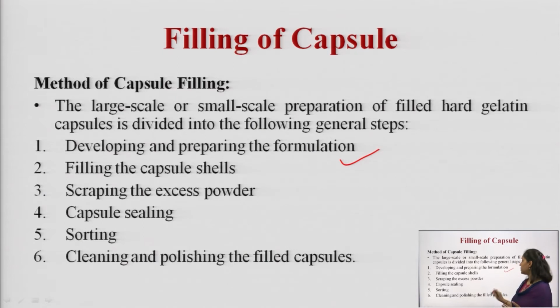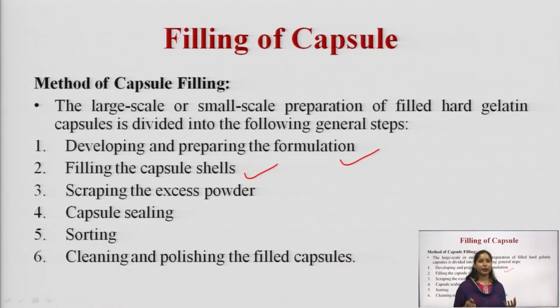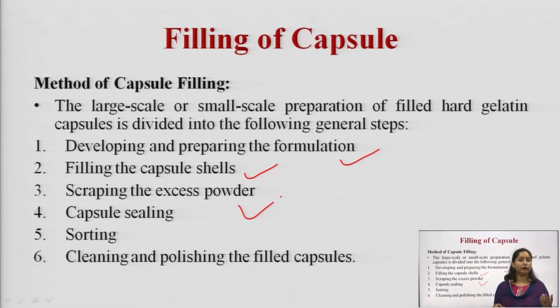The other step is filling the capsule shell. Whatever formulation you have prepared in the previous step needs to be filled into your empty hard gelatin capsule shell. Then scraping the excess powder. You have to remove the excess powder. Then next is capsule sealing.